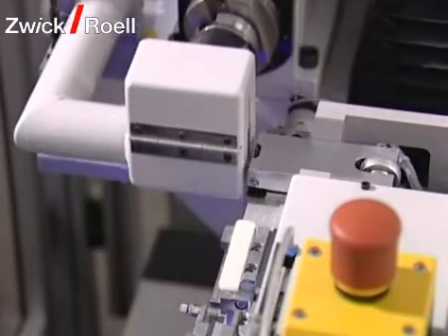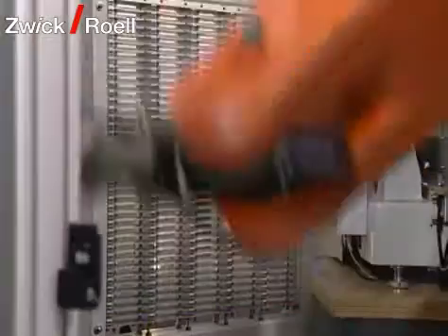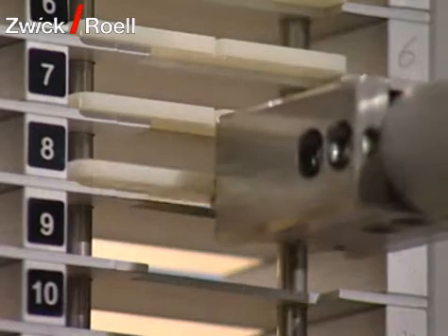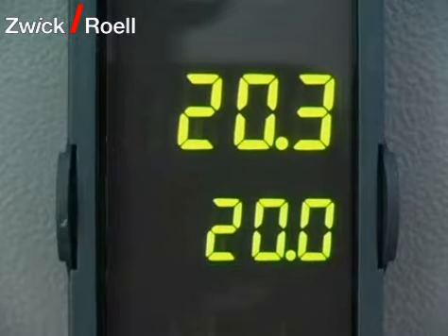After notching, the specimen is taken over by the robot again and placed in the interim magazine for a rest. The notched specimens are temporarily stored in the interim magazine until either the pre-selected temperature in the temperature chamber has been reached, or the resting time of the specimens after the notching process has passed.